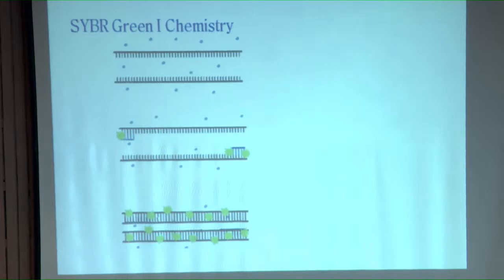You remember this point, right? This is a unique property of SYBR Green dye. It has a very specific affinity for the minor groove of double-stranded DNA, right? So that means as every cycle passes, the freely available SYBR Green in the PCR mixture is going to intercalate in double-stranded DNA, which is going to increase in number with every passing cycle. Is it clear to all of you?